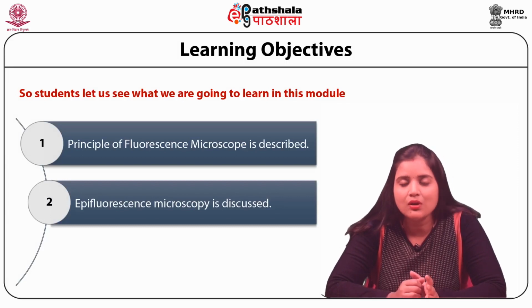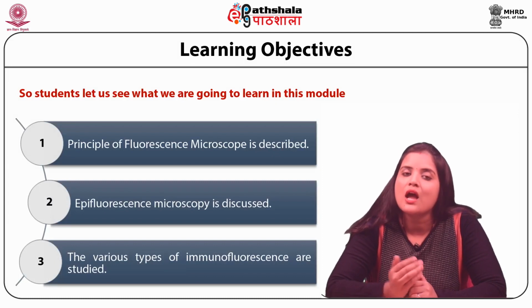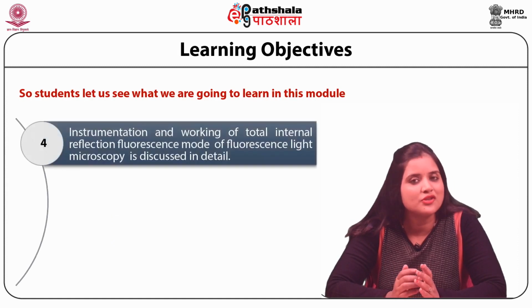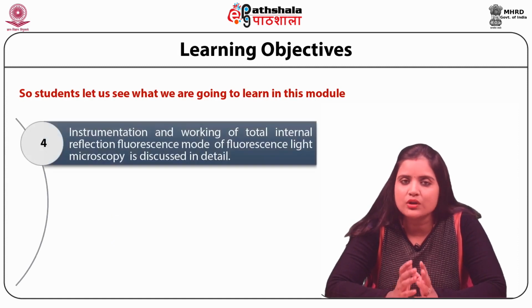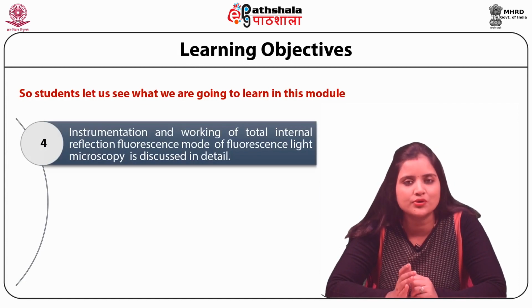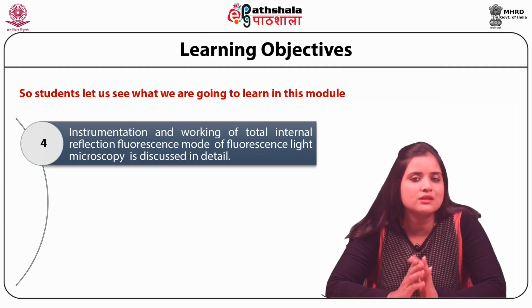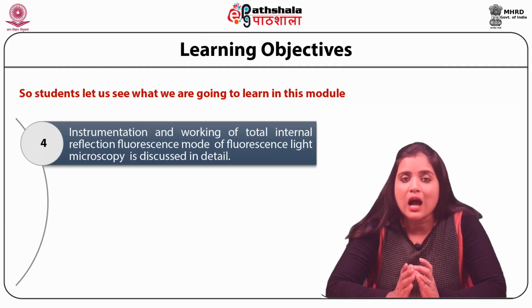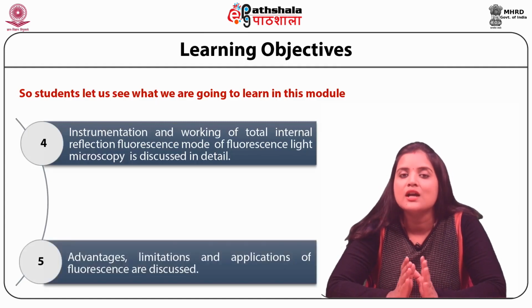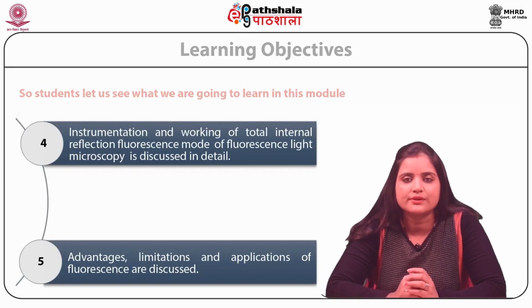In this module, the various types of immunofluorescence are studied. Also, the instrumentation and working of the total internal reflection fluorescence mode of fluorescence light microscopy is discussed in detail. At the last, we will study the advantages, limitations, and applications of fluorescence.